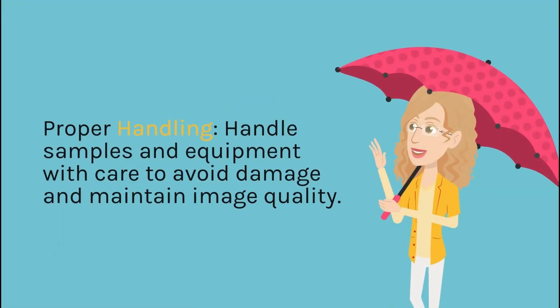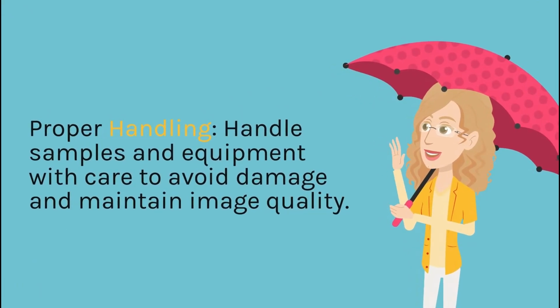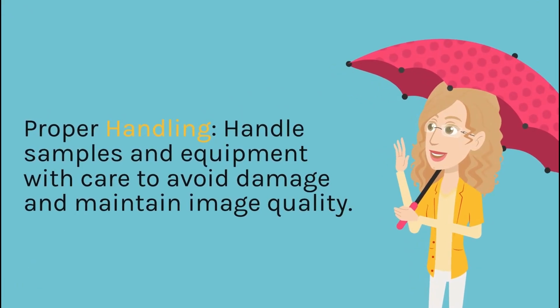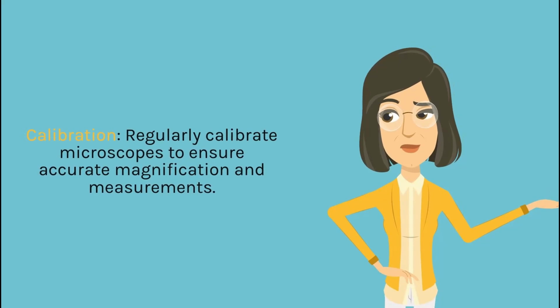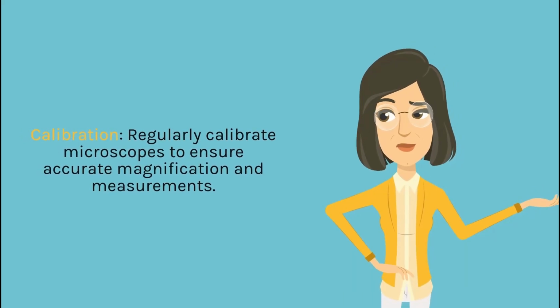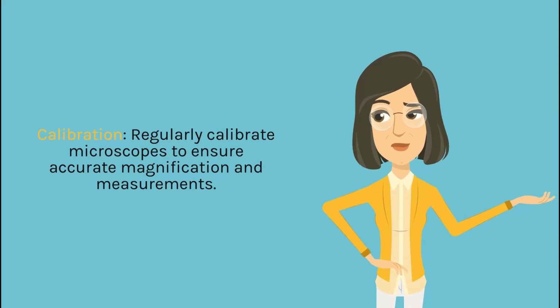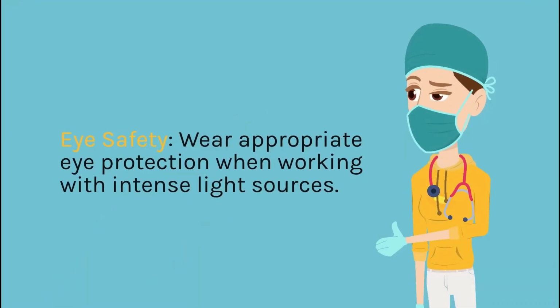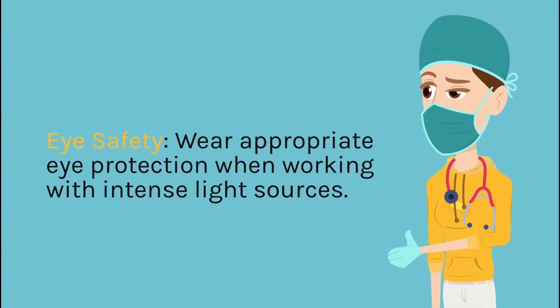Proper handling, handle samples and equipment with care to avoid damage and maintain image quality. Calibration, regularly calibrate microscopes to ensure accurate magnification and measurements. Eye safety, wear appropriate eye protection when working with intense light sources.